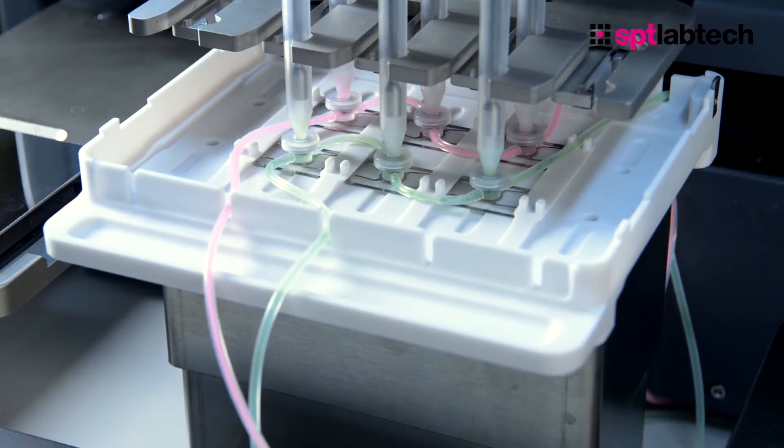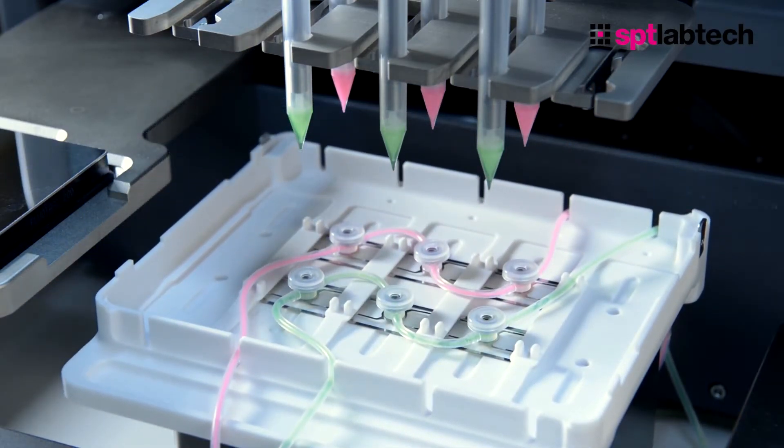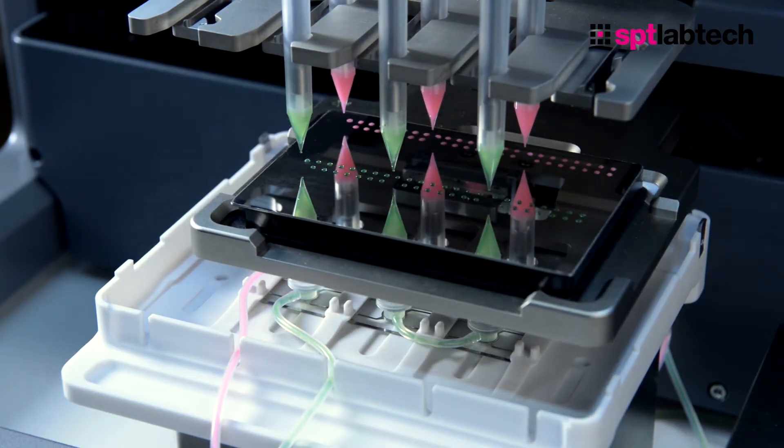Other applications where this can be really useful is in high throughput screening, where multiple plate runs will be required. In this case, liquid can be continuously pumped in a recirculating fashion to the Auto Feed Reservoir port on the Dragonfly.